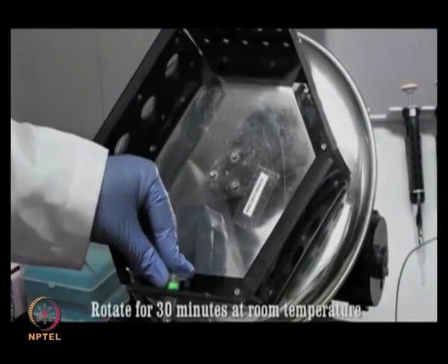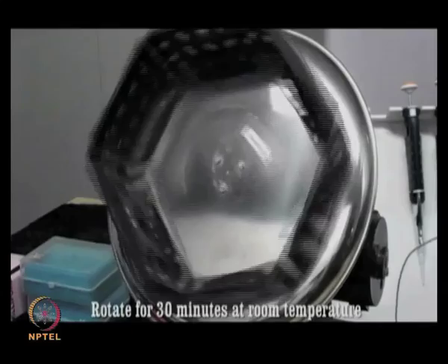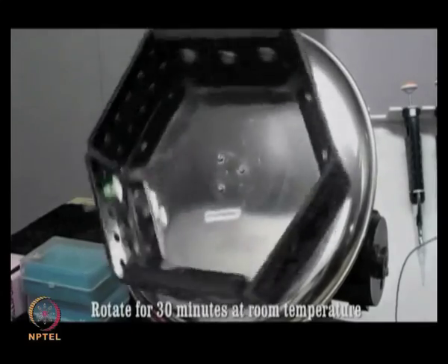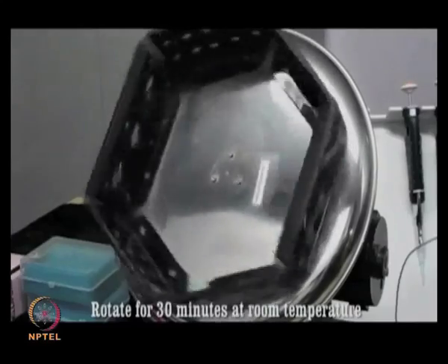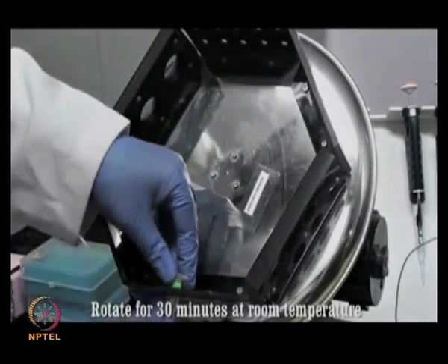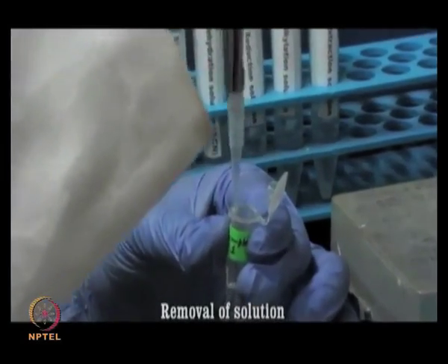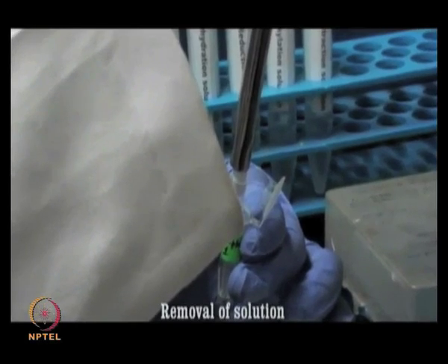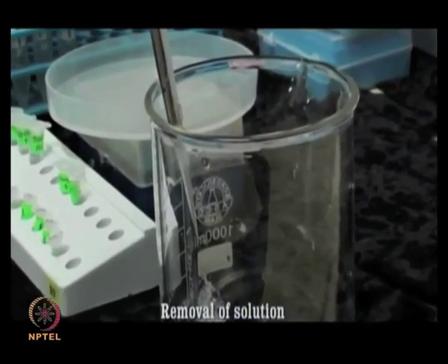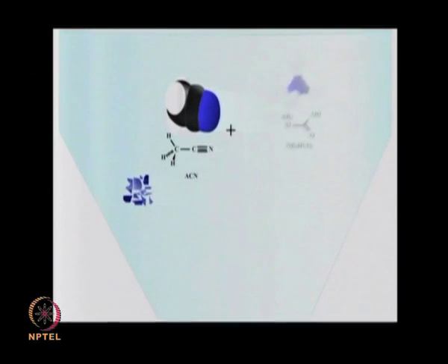After addition of the stain removal solution, rotate it on a shaker for 30 minutes at room temperature for complete removal of the stain from the gel pieces. It is recommended that you change the solution after every 10 minutes. By changing the solutions after every 10 minutes, the Coomassie Brilliant Blue stained gel pieces become colorless.